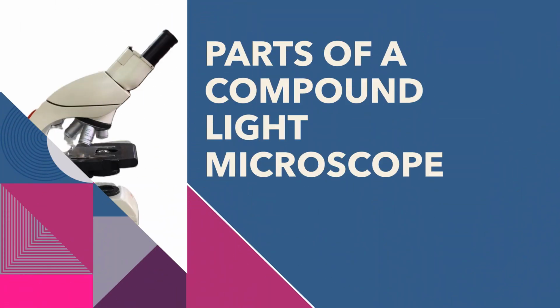Welcome to PK Tech Lab. Today, we'll be talking about the compound light microscope. If you would recall, in our previous video, we made mention of the fact that the microscope is one of the basic instruments one would find in a biology lab, especially a plant anatomy and physiology lab. So today, we'll go a little more into details about the microscope.